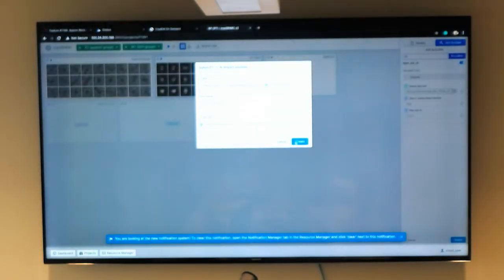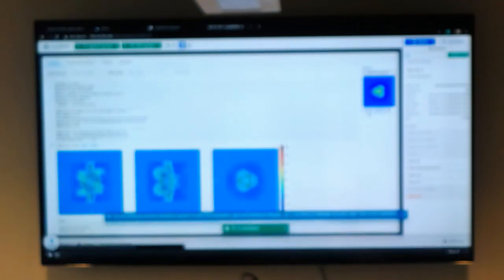Every time you run, don't forget to use the workshop node, and this is importing a volume. This is just to show you how CryoSPARC views volumes. It shows you in 3 orthogonal slices. But why I'm showing you this is that in here you can actually download a map. This goes straight into your downloads folder, and then you can view it. That's also why we asked you to make use of Chimera. If you don't have Chimera installed, we will walk around and try to assist you.